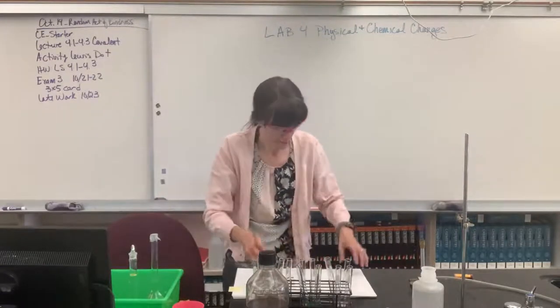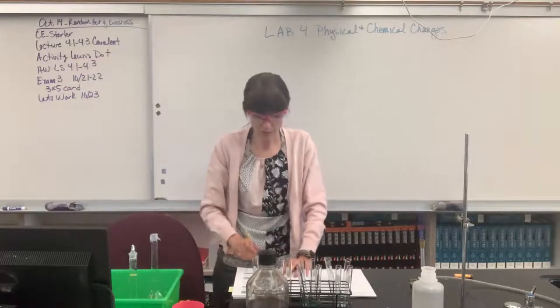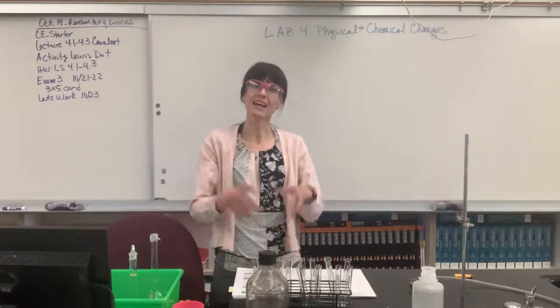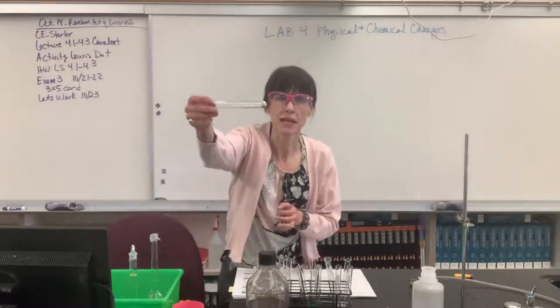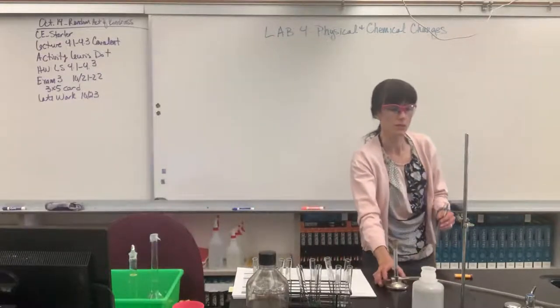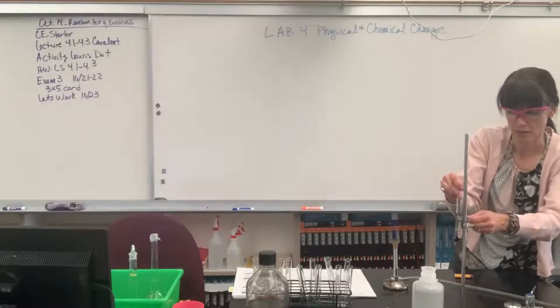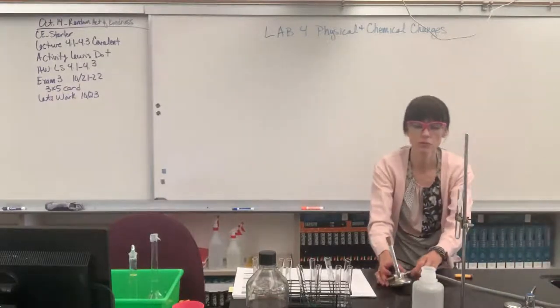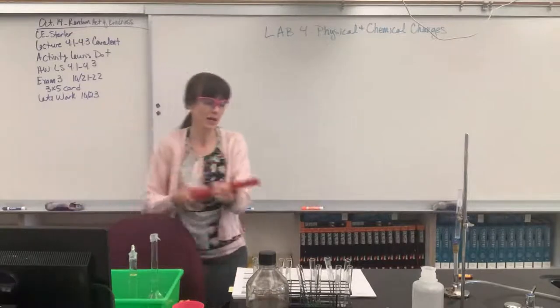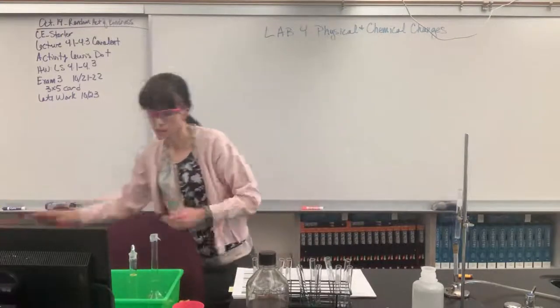Okay, now I think we're supposed to heat this. Let's go back to part B, and we are on step 4. It says mount the other test tube on the ring stand as shown in figure 4.4 and heat the sample very strongly. So I have what's called a test tube clamp. Here is the sample I haven't done anything with, and remember how it's green. You guys see that green right there. I am going to flip this over, put my test tube in the test tube clamp, secure it. Nice. And then you put the Bunsen burner right underneath that. I'm going to time that with my iPad for 5 minutes. Clock starts. Okay, so we got 5 minutes on the iPad.